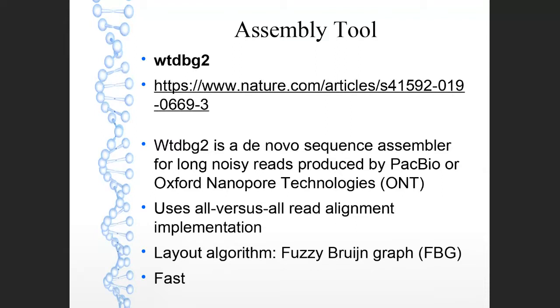The reason why we've specified that number of threads to use is that we want to try and keep enough headspace so that several people can do this practical simultaneously. If we were to run it faster, then we would potentially take up all of the cores on the server and no one else could work on it. So we don't want that. So be patient with these assemblies.